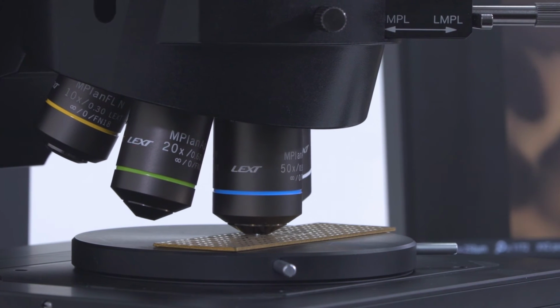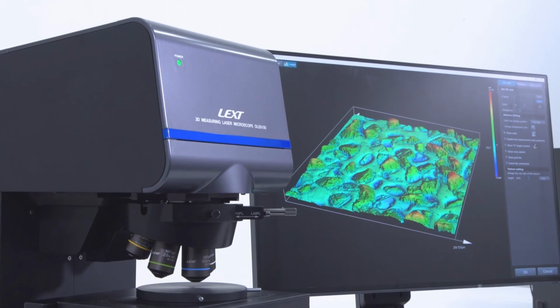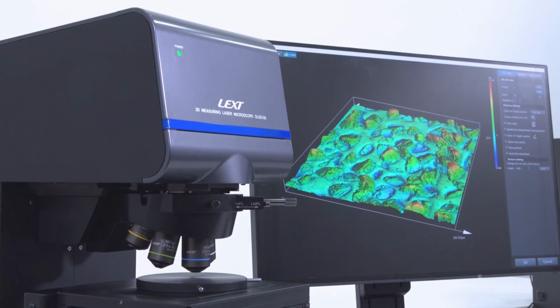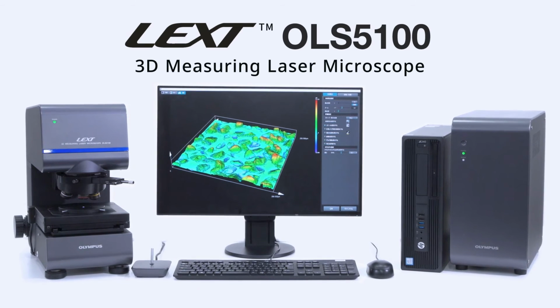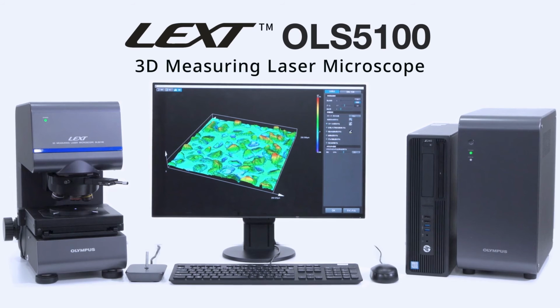Take your surface metrology to the next level with the LEXT OLS5100 3D Laser Confocal Scanning Microscope. Experience the accuracy, ease of use, and efficiency of the LEXT OLS5100 Laser Microscope for yourself.